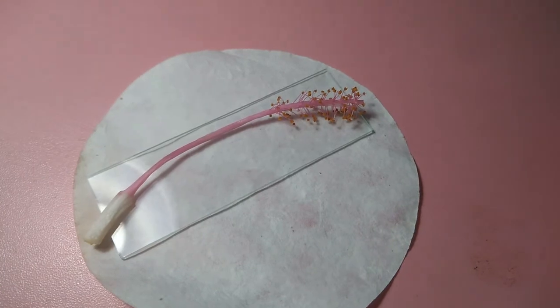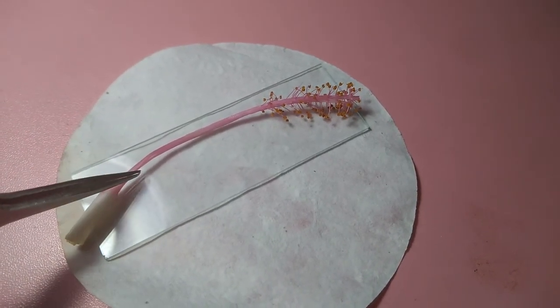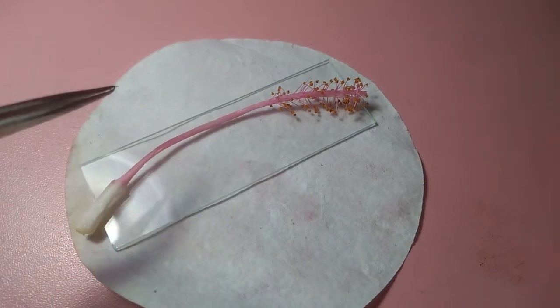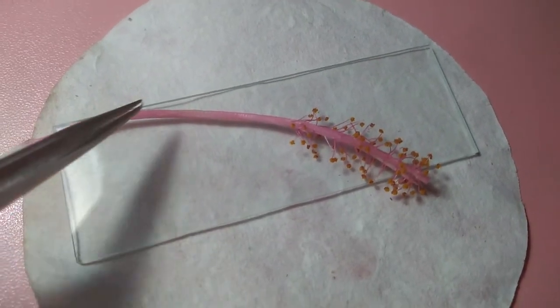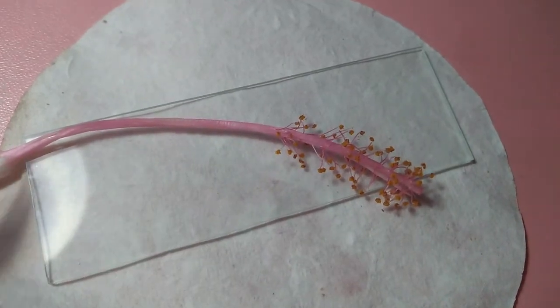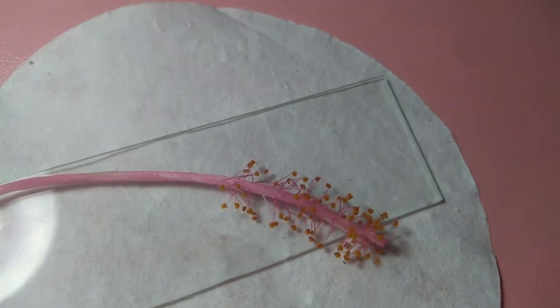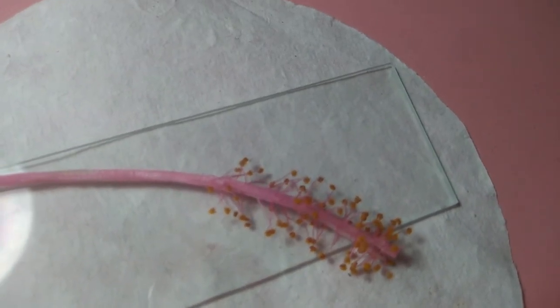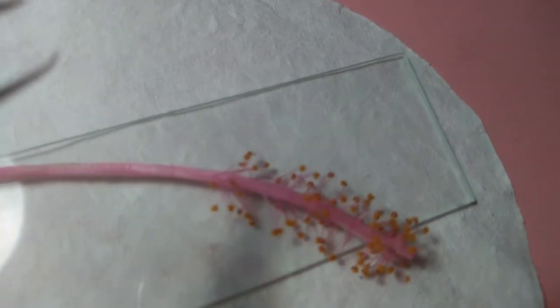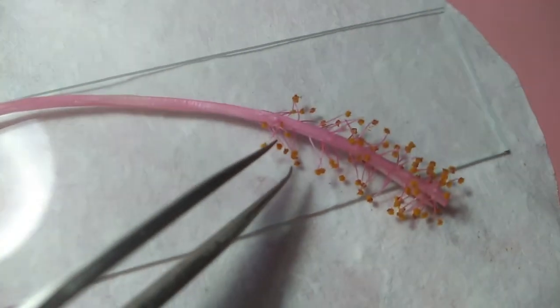After that, we will talk about our male reproductive part or this monadelphous stamen that we have found in our hibiscus plant, where we have our staminal column. This is the tube-like structure. This tube-like structure is the monadelphous staminal column, where the filaments have joined together to form this tube, which covers the style of our pistil. And then we have our anthers here, these yellow dot-like structures.